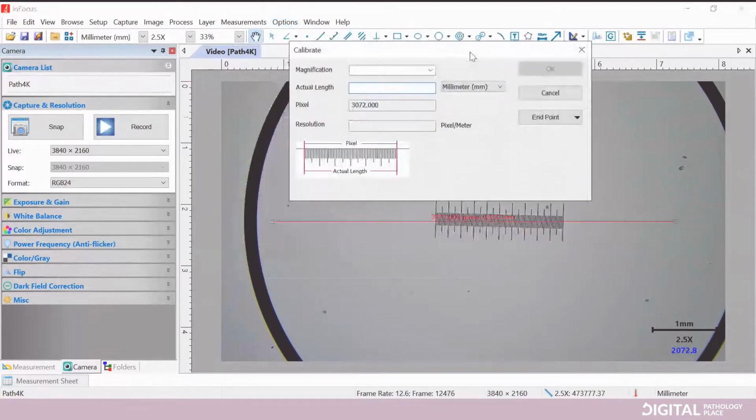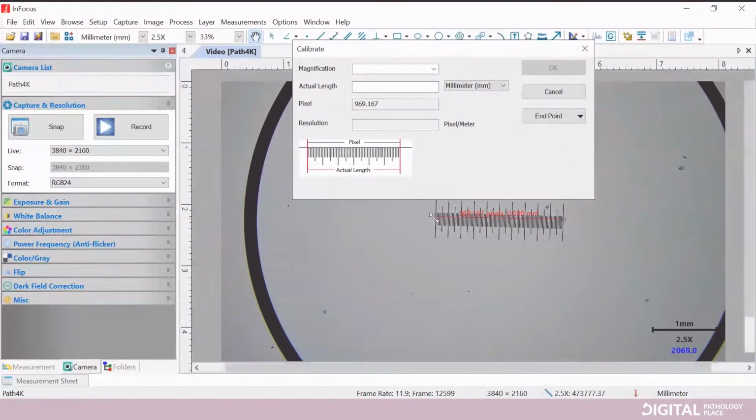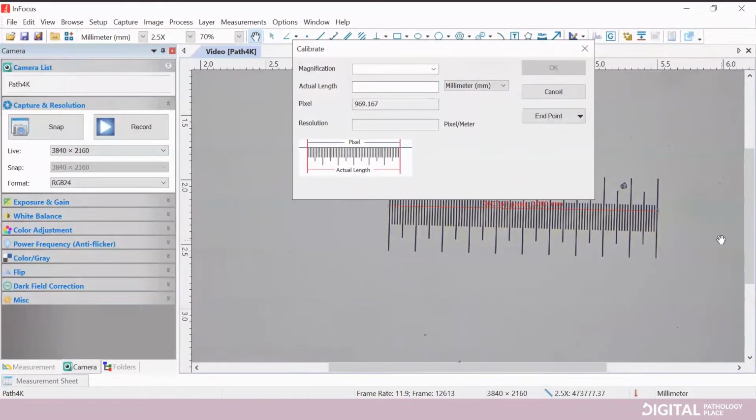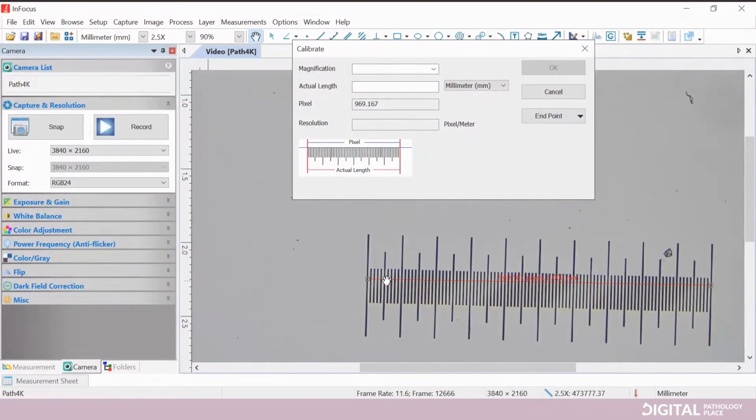So in this case, again, you want to just get the lines at low mag. You just want to get these approximately close here, okay? And then again, the shortcut here is holding Control and scrolling up with my mouse wheel. That does some zooming in, so it allows us to fine tune and make sure we are at the right spot. So here, okay, we're at the right-hand side of that line.